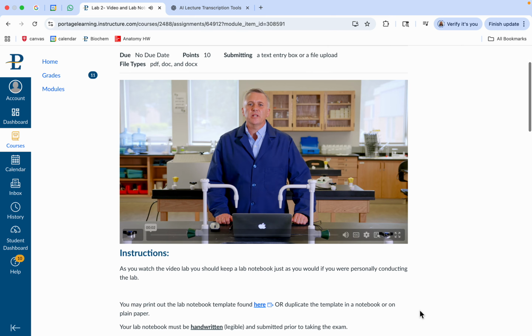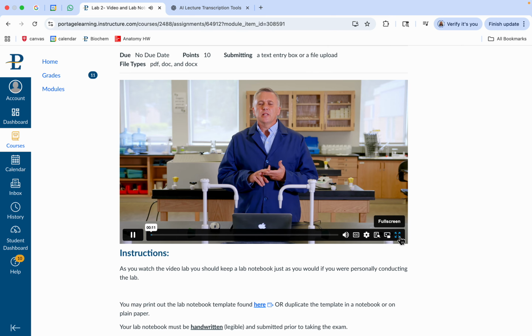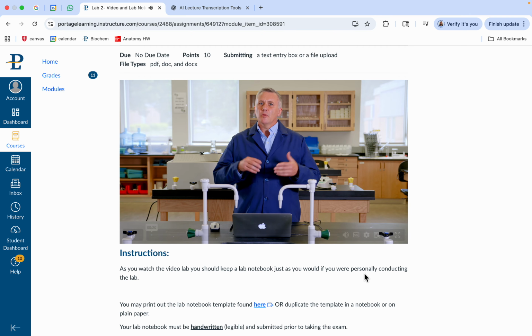To experiment 2. In this session, we're going to be looking at intermolecular forces and also buffering. Now, you might say, what in the world do those two really have in common? Why are we putting those two together? The commonality is that both of these subjects are important to biology because much of biology takes place in water-based systems. And so because of that, we need to really think about the forces that occur between biological molecules, and that would be largely intermolecular forces.